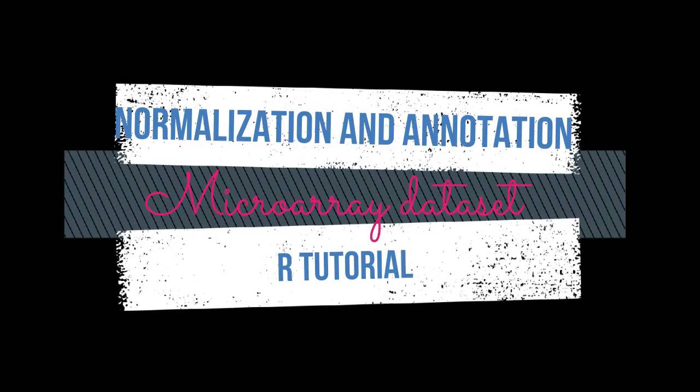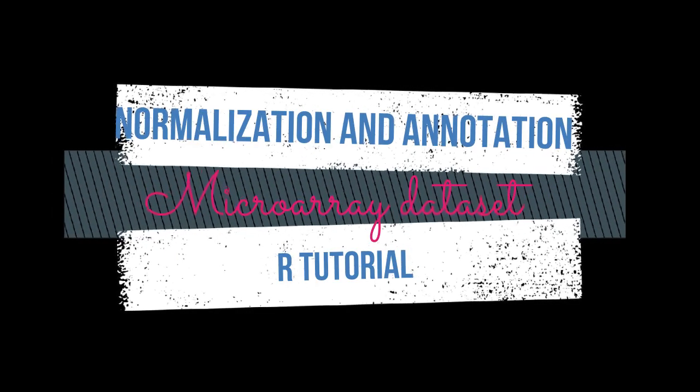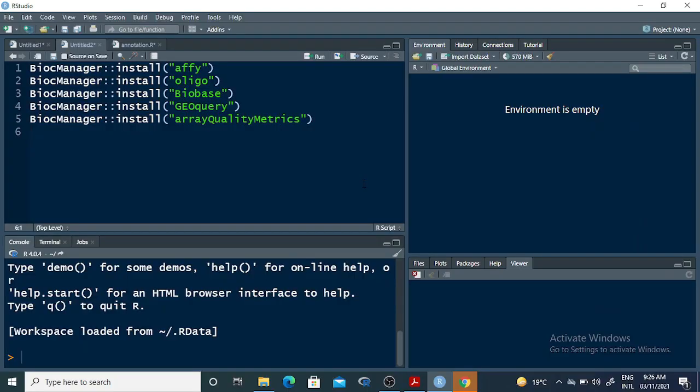Hello everyone, today in this tutorial we will talk about how to perform RMA normalization and then annotation using a microarray dataset. For that, we first need to have RStudio or R installed in our computer, and then we need to have a microarray dataset which will be used for performing the RMA normalization and annotation.